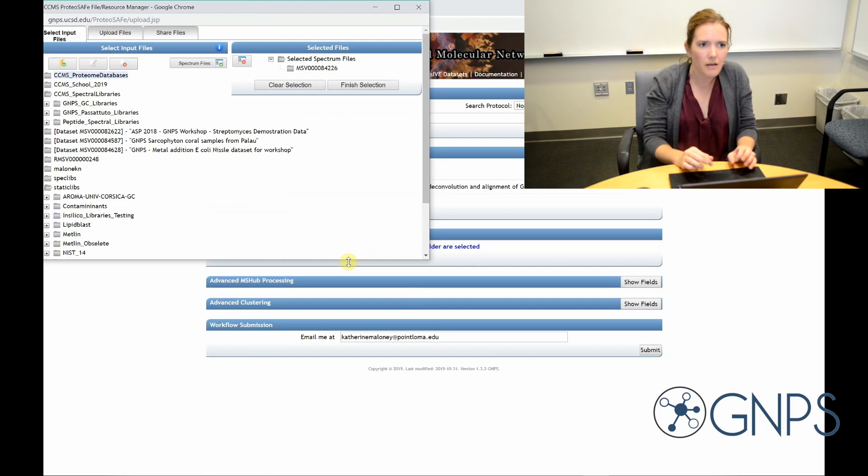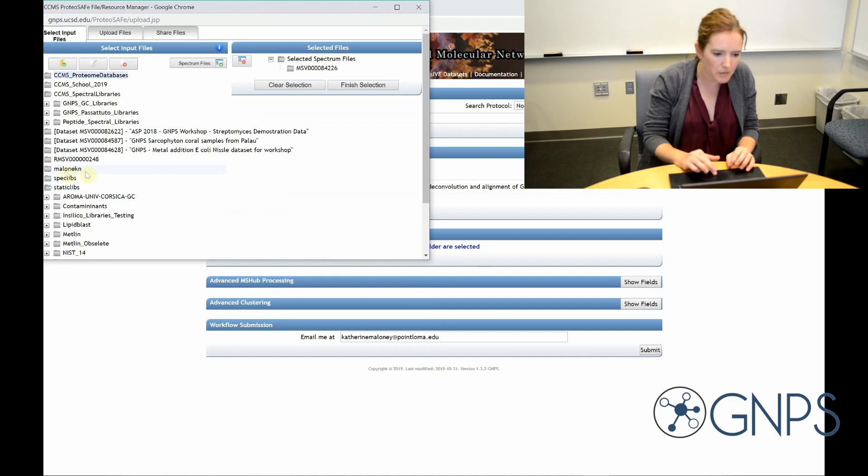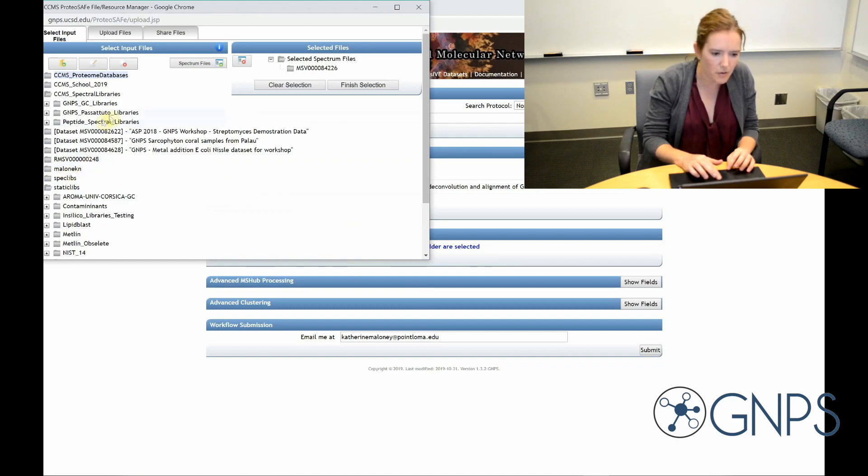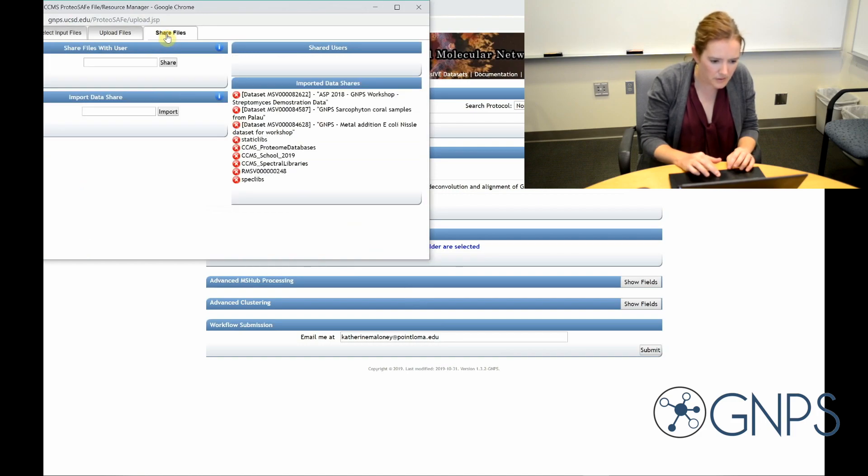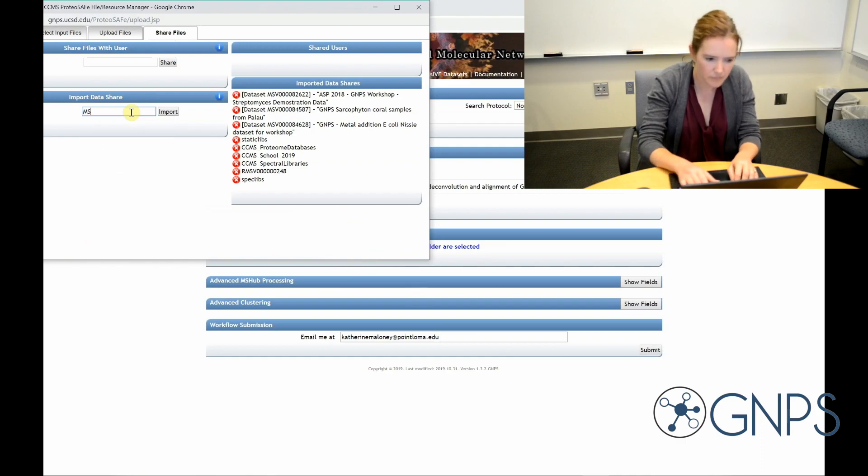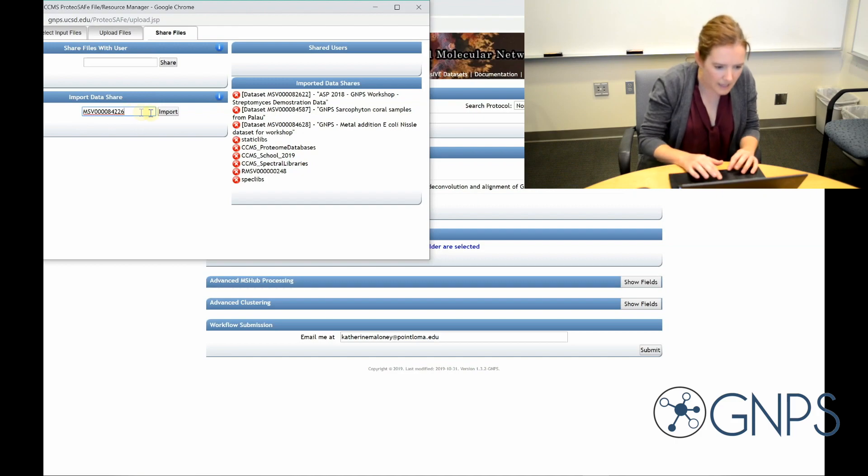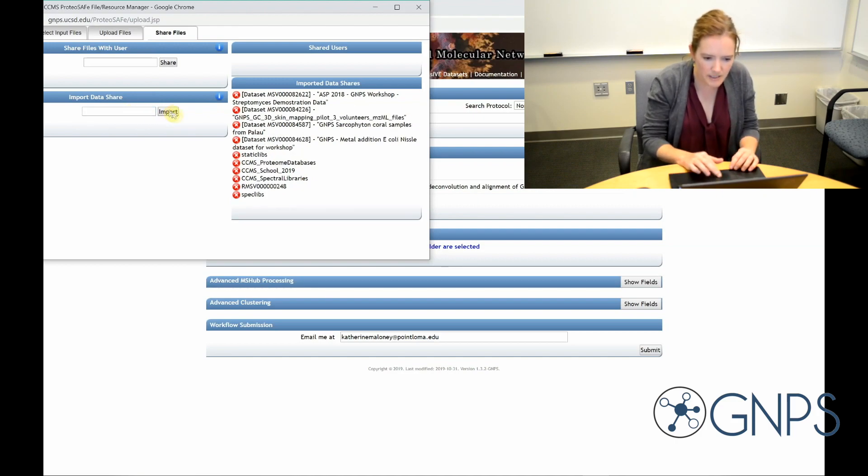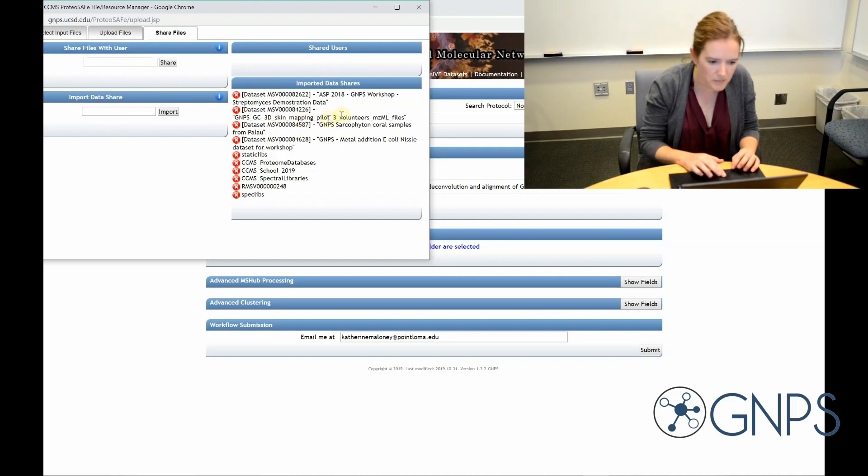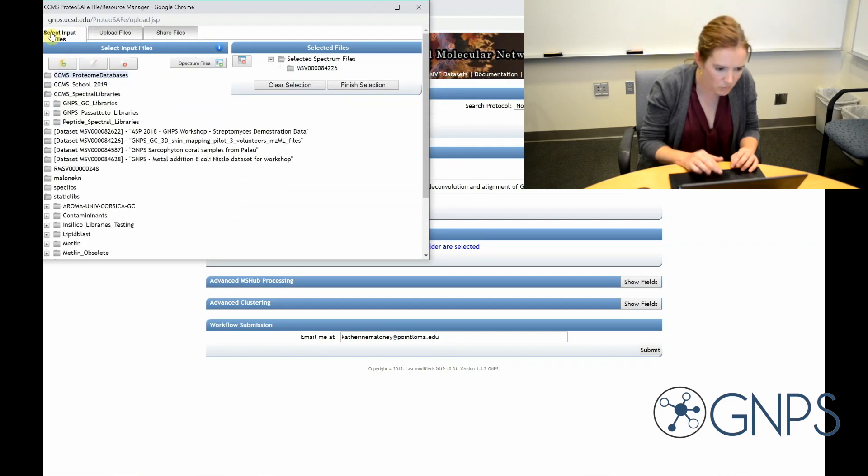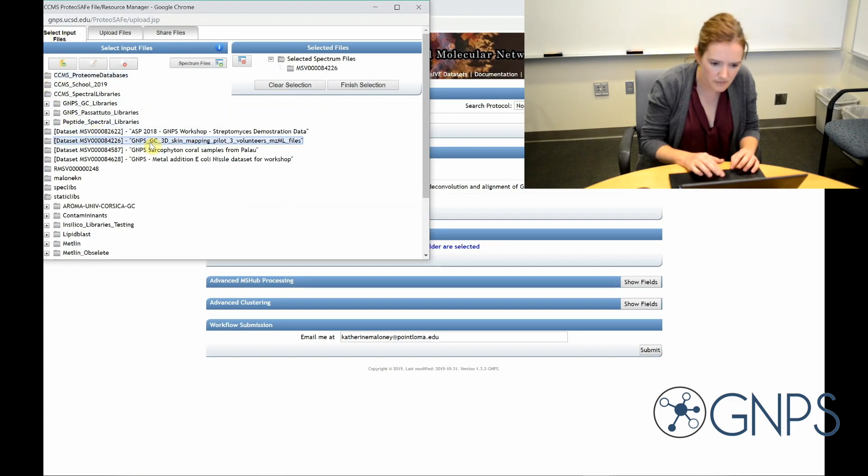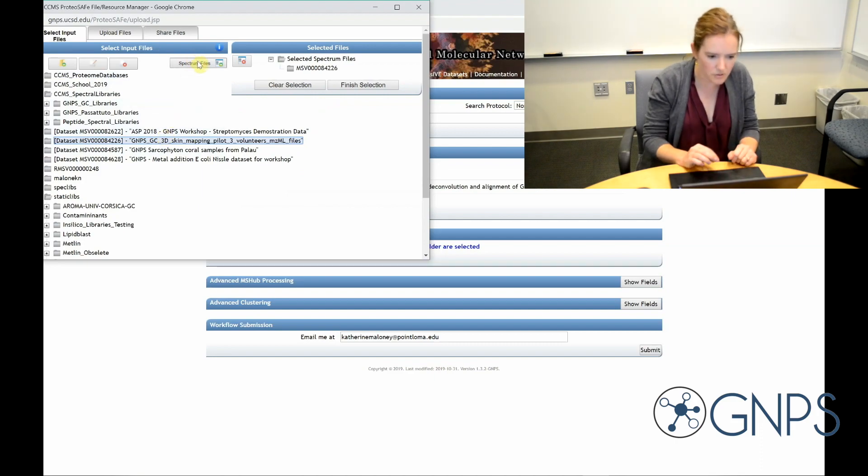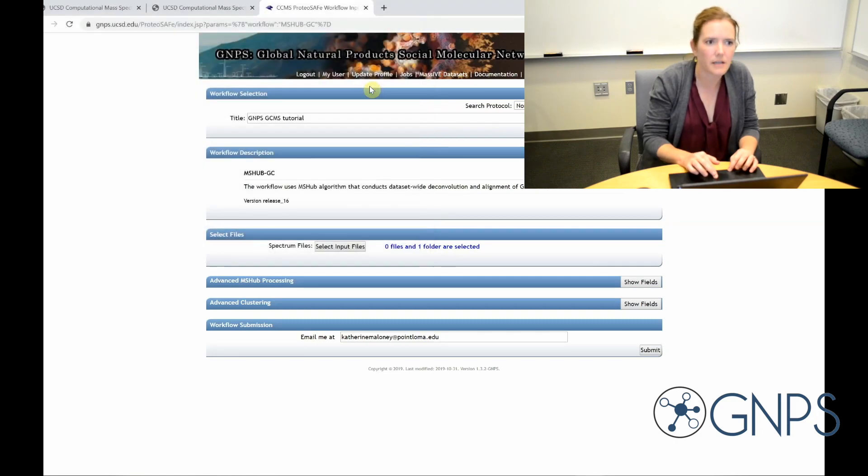And from here, this is where I could select my own files over here, but I'm going to use one of the massive data sets. So I'm going to go here to share files. I'm going to type in the massive number. Click import. And you can see that the file pops up over here. Now I can go over to select input files and go ahead and insert those there. So I'm going to finish that selection and come back over to here.